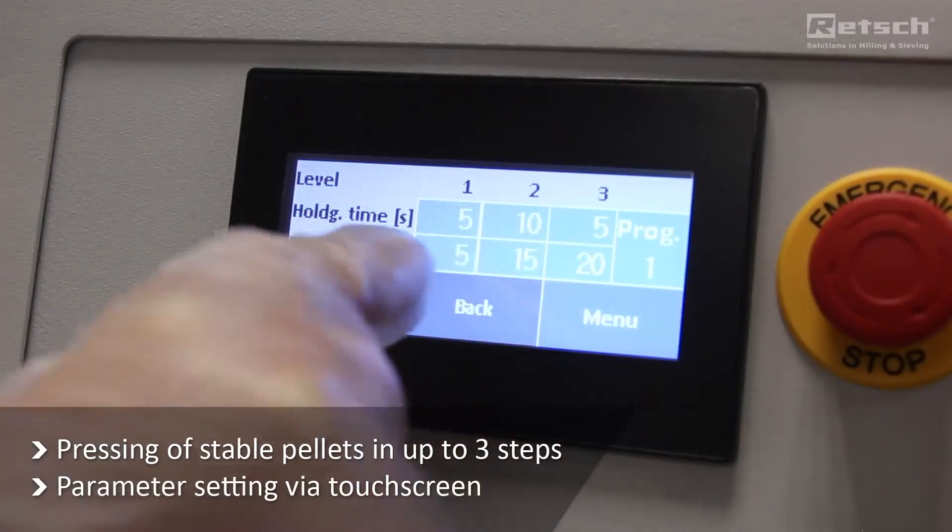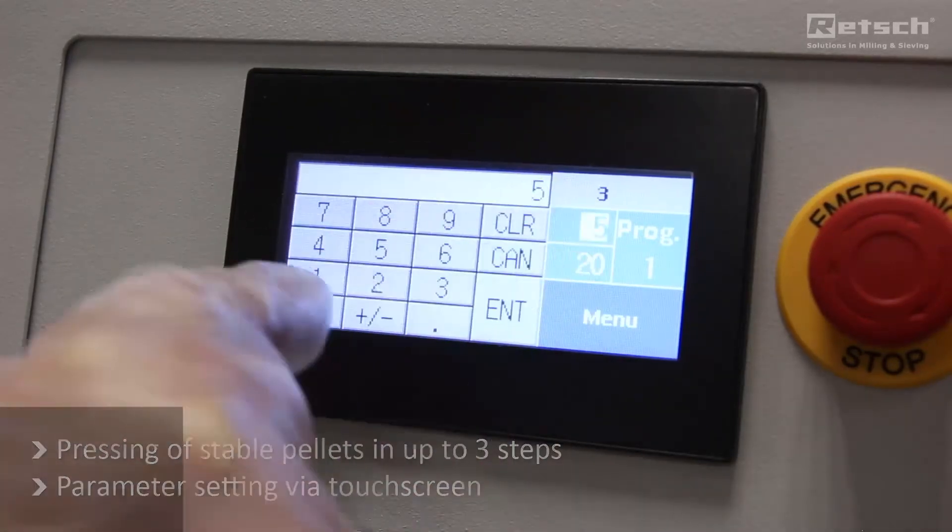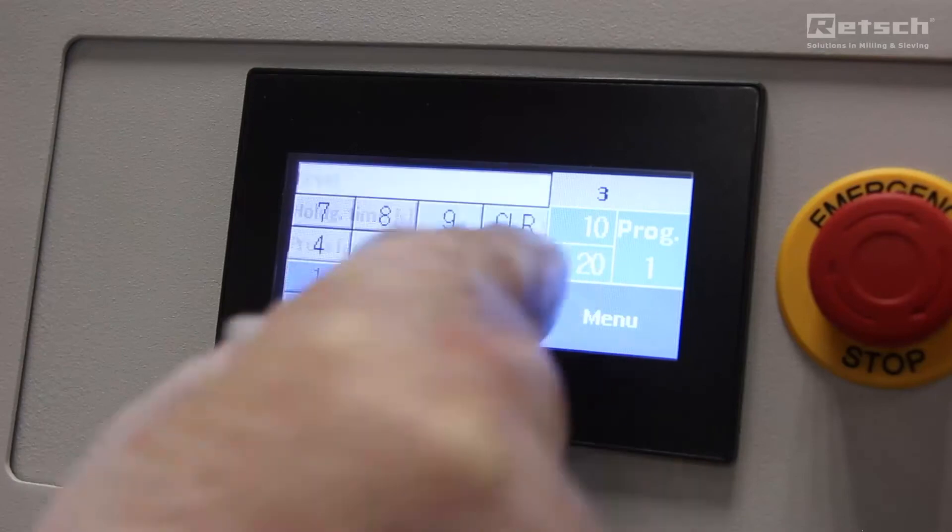Operation of the PP35 is convenient and safe. Pressing can be done in up to three steps with increasing pressure force. Time and pressure force are set via touch screen.